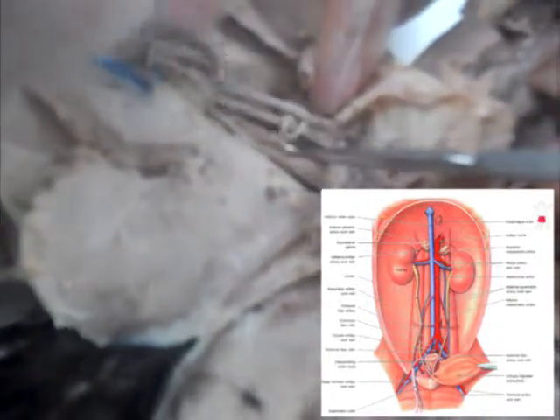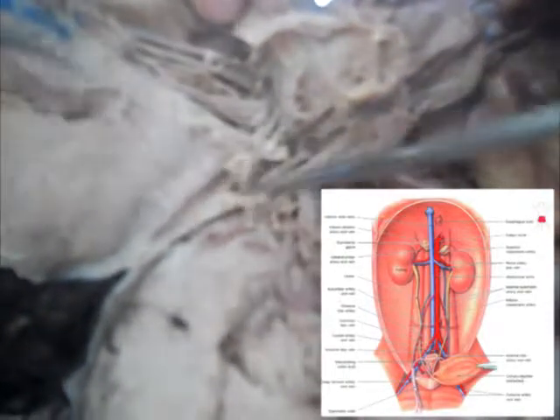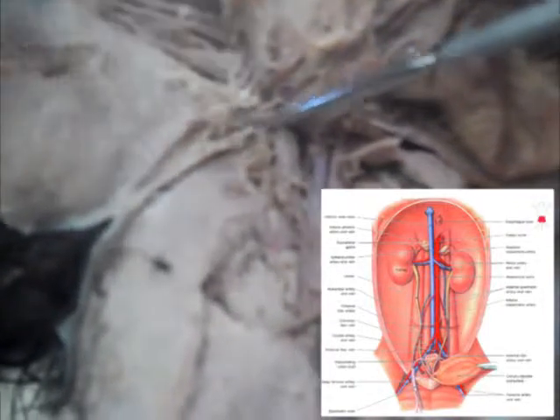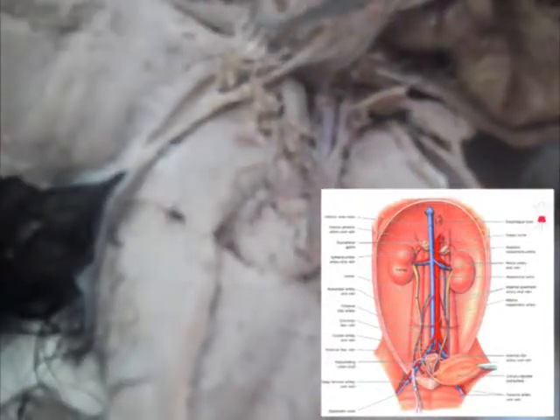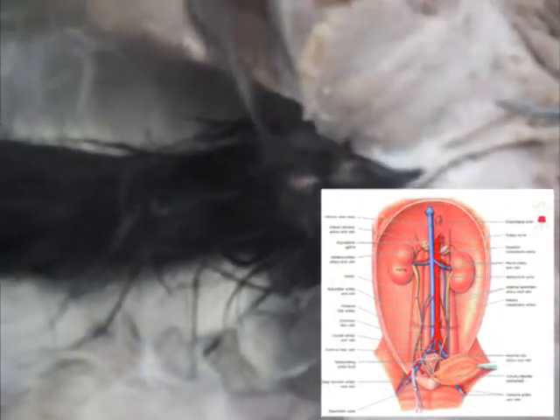And then the spermatic cord that we showed you earlier reaches all the way around the testes area to supply blood to, since our cat's male, the gonads, which are the testes, right here. And that's it for the cardiovascular system.